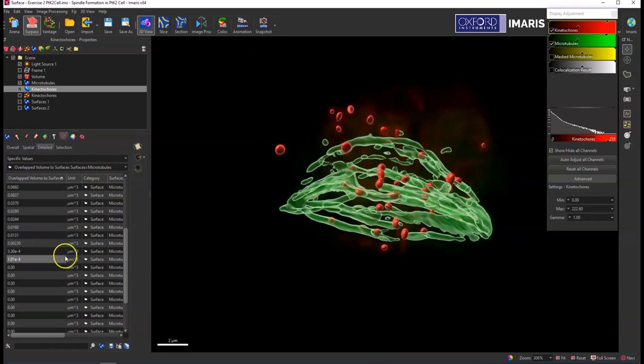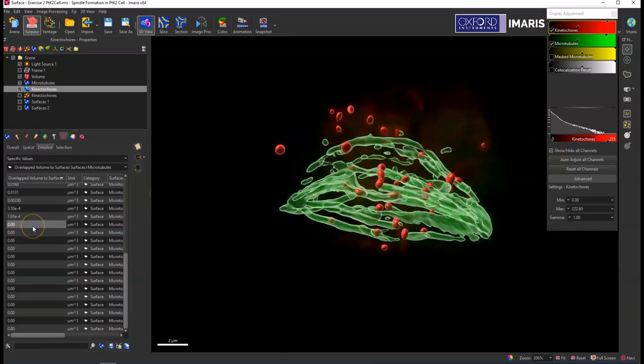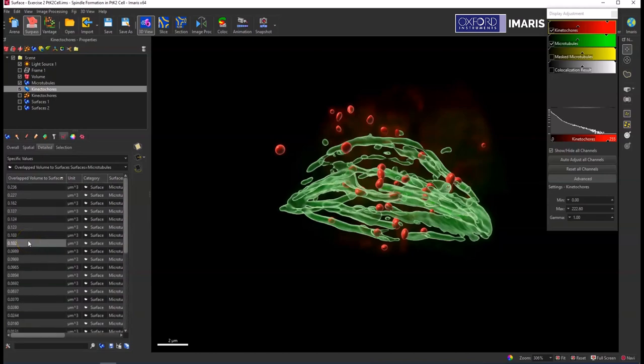And you can label these objects if you would like to, filter and then label them, or do it in a classification step within the creation wizard or even in batch processing. So there's a lot of different things you can do with this statistic.